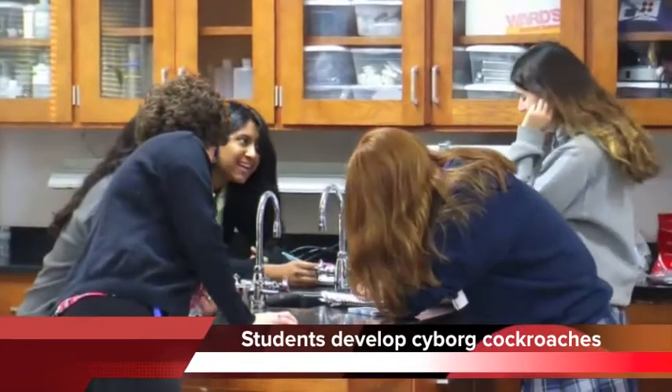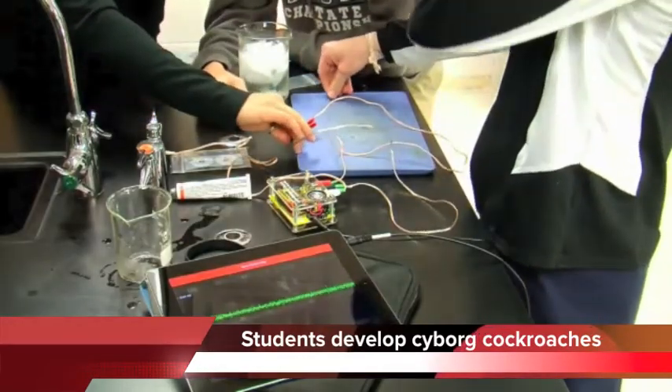In AP Biology, we're at the point of the year where we study the nervous system and wanted this to be a little more hands-on for the kids. Go, Arthur, go!